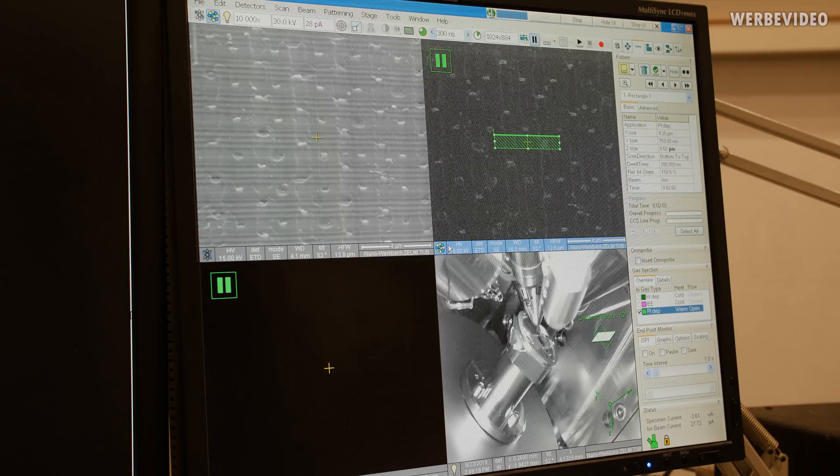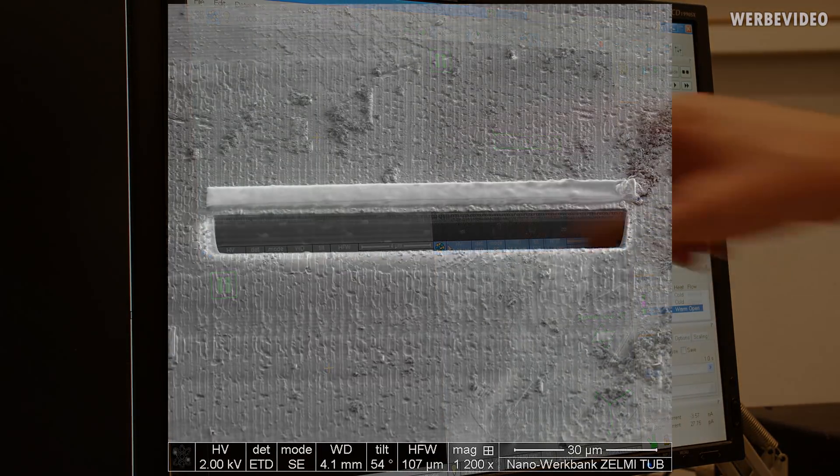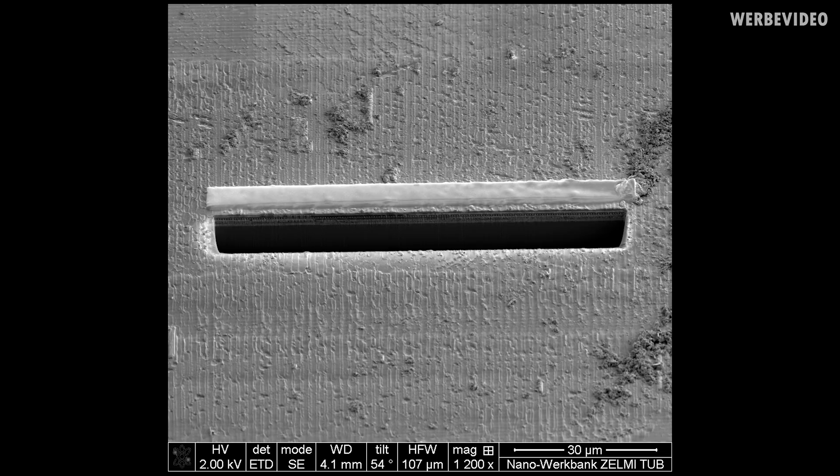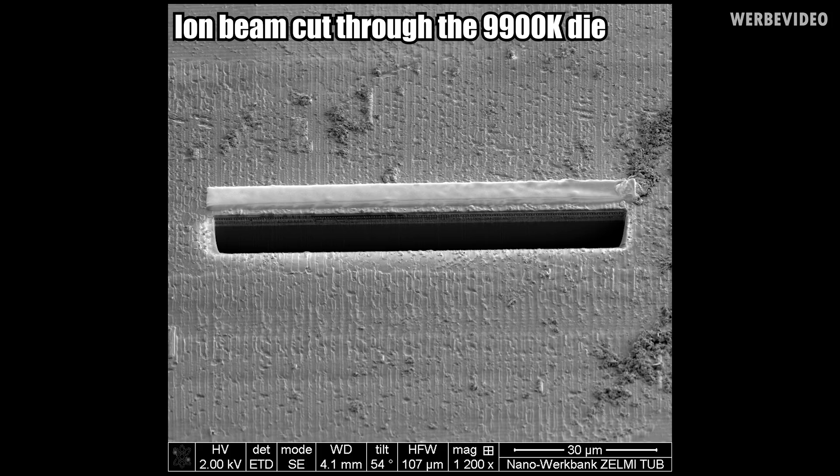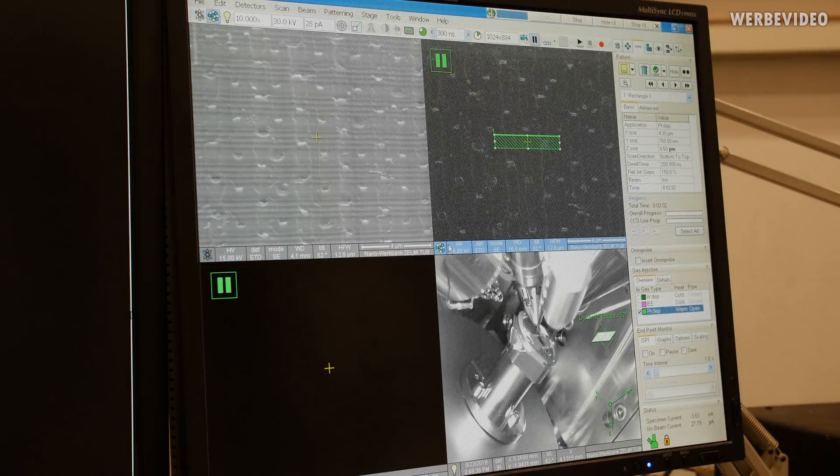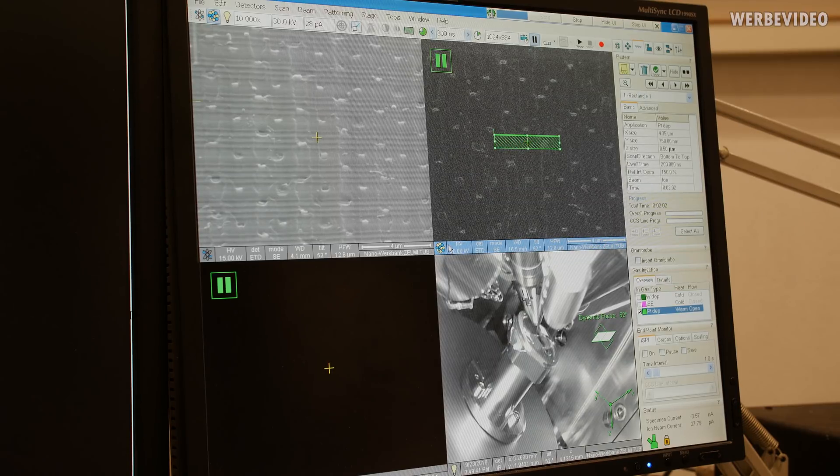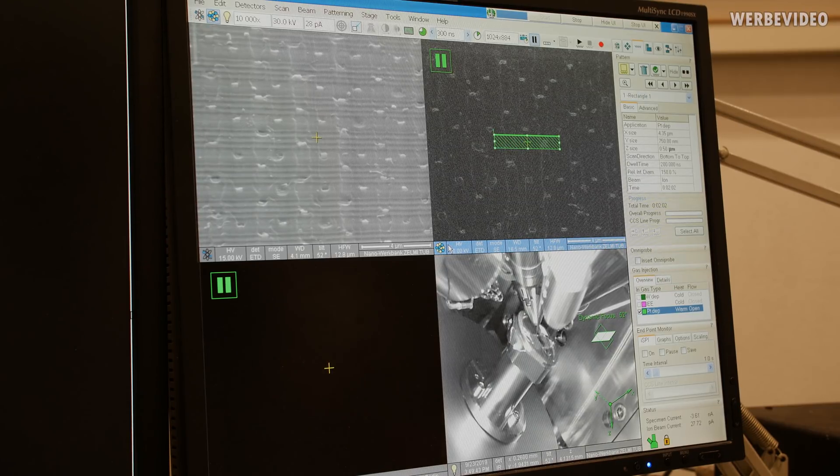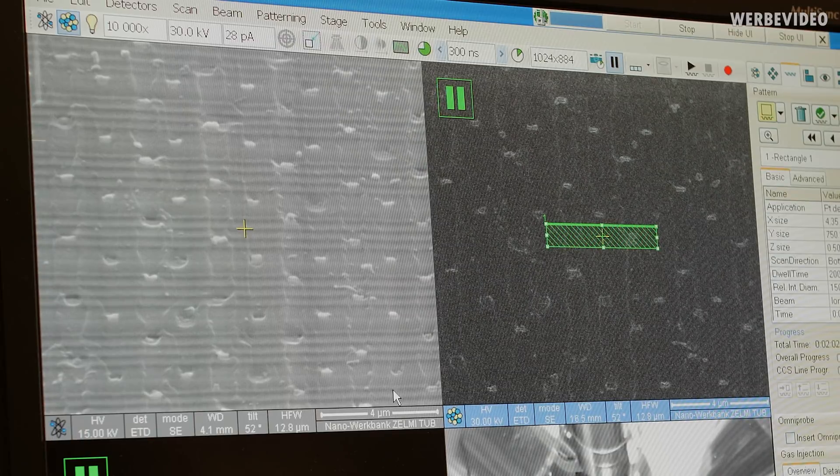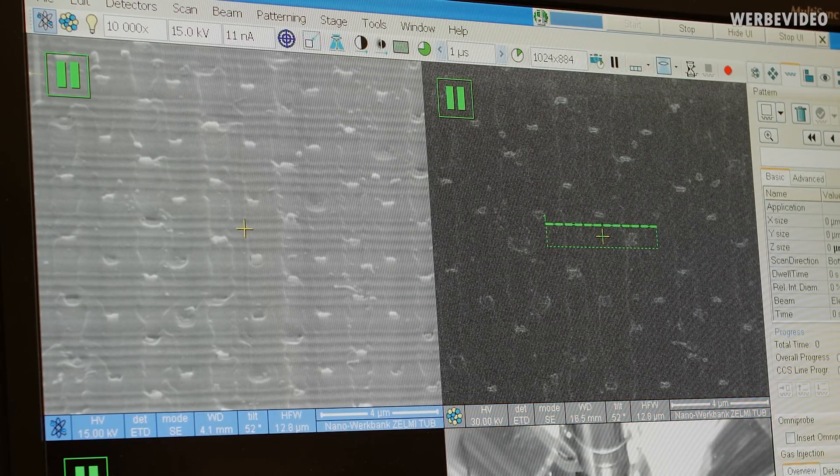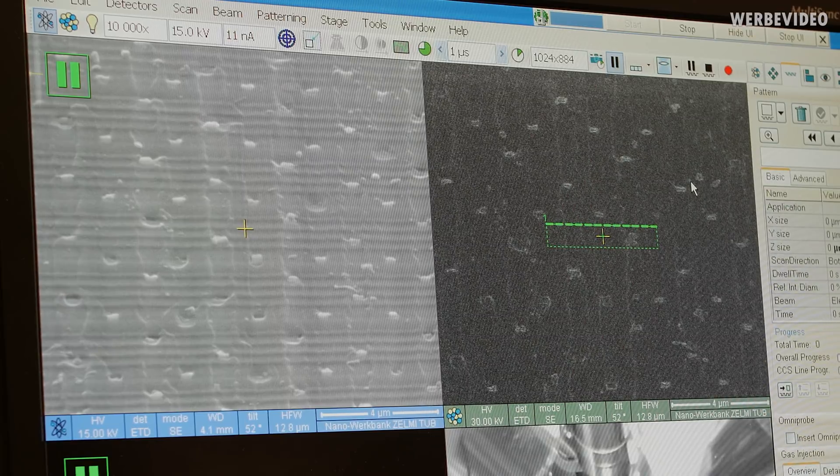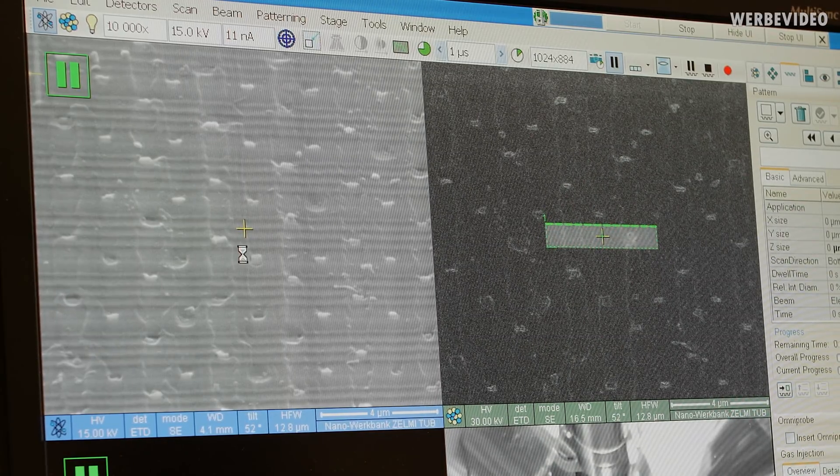And so I will now use the ion beam to remove material here. But unfortunately, the ion beam is not as well focused as it should be. And for this purpose, I'm going to deposit first some metal layer here. This will be a platinum deposition layer. And this will protect the surface of our specimen. And I just start here.